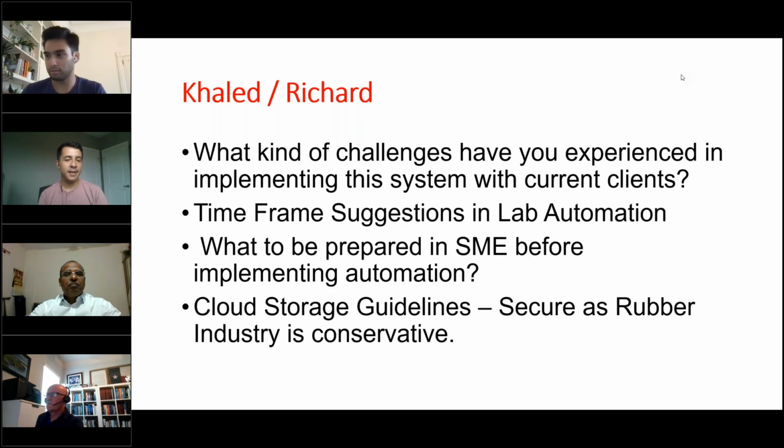So I think the time frame, in terms of suggesting when to start implementing automation for customers, I would say as soon as you find a need. Find the most important thing in your lab, whether it's the software or hardware, that gives you a great return, that proves out the concept of automation, that brings benefits to you, and start somewhere. Start small and build out. Don't try to solve everything at the same time. That's a big problem that we see with people. They go for all of it and it usually fails because it's too much to take at once.